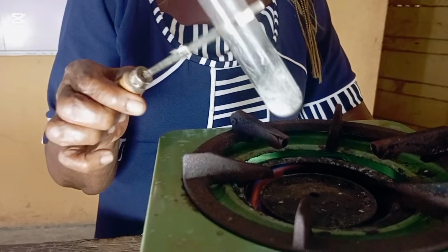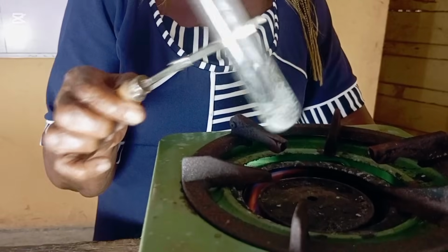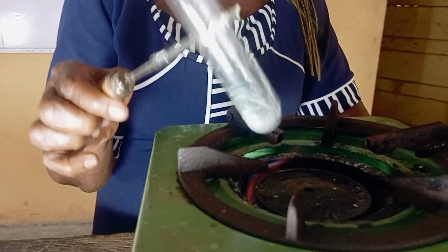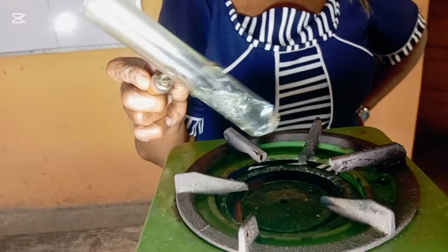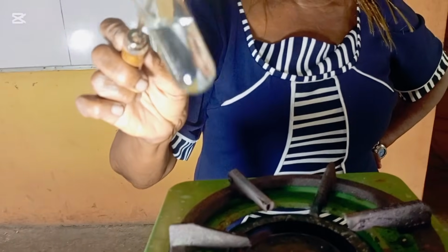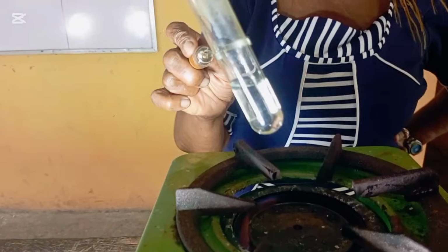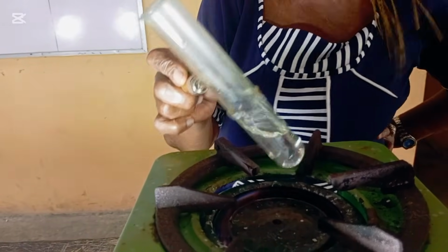So when you heat up the solution or the suspension, you notice that the white PPT will dissolve. It will disappear. You will not see it again because lead 2 chloride is meant to be soluble in hot water. Just like I told you, it has all disappeared. So the white PPT has disappeared. So when you allow it to cool, it will reappear. That is a confirmatory test for lead 2 ion.